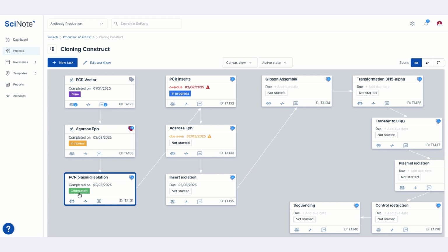The status shows how far along we are in the particular task. This is the direction of the task status flow. The task can be moved between not started, in progress, completed, in review, and done. The last two are only available in plans that include electronic signatures.